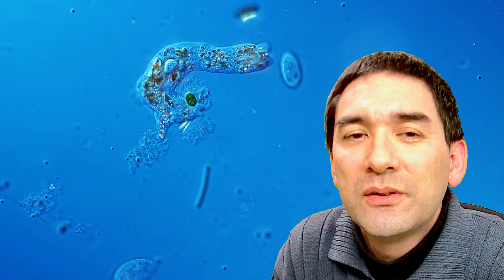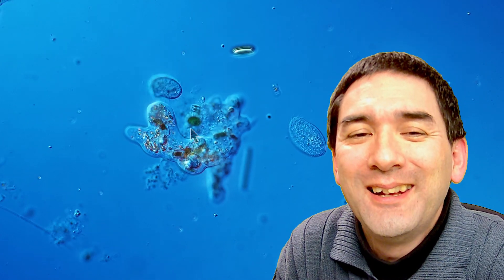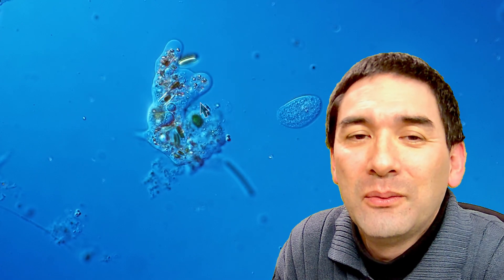But I think over here it didn't quite manage to do that. Okay here again, it tries again. It's trying to flow around this central cell apparently, but it turns out to be a little bit too big so it just gives up and moves on.